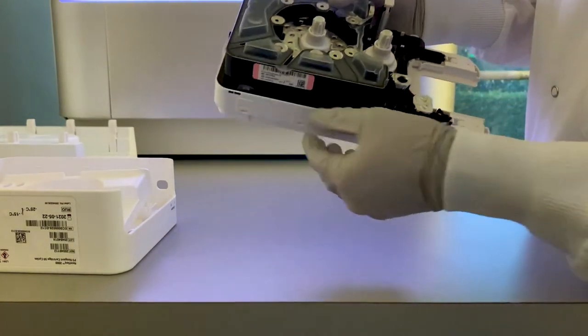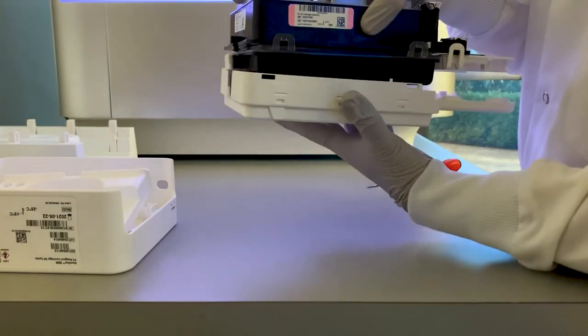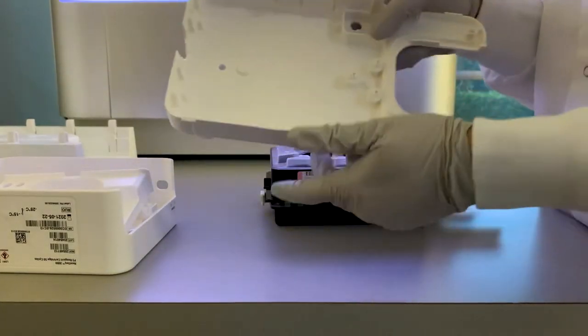To remove the reagent well plate from the lower assembly, disconnect one snap on one side of the lower assembly, and then remove the reagent well plate.